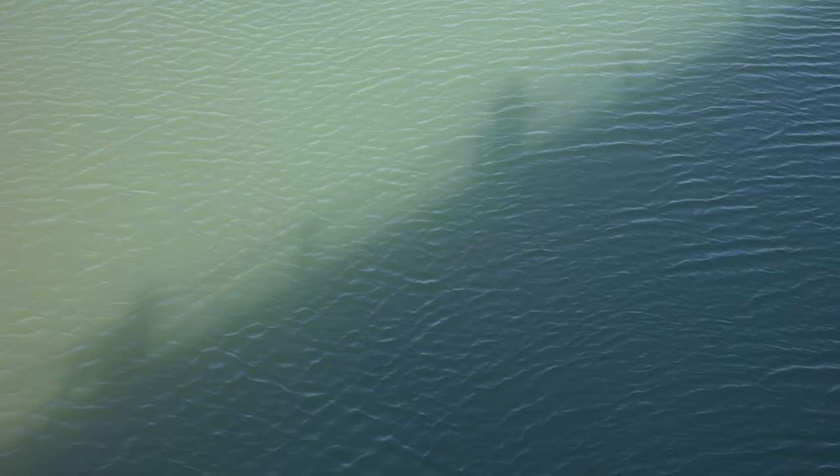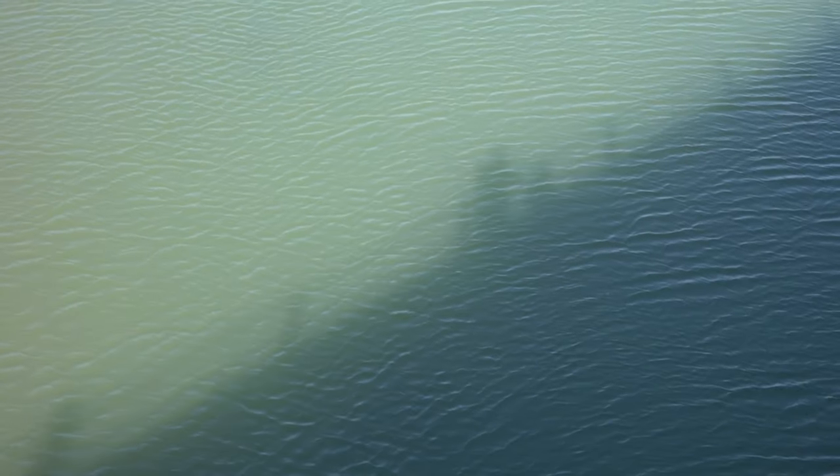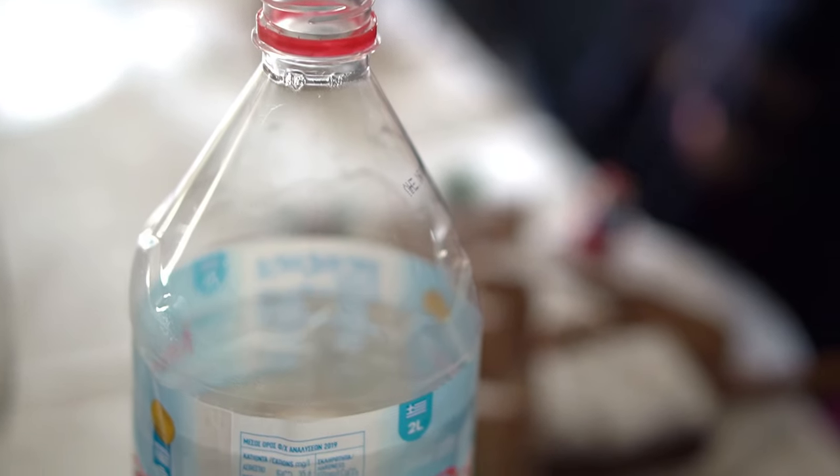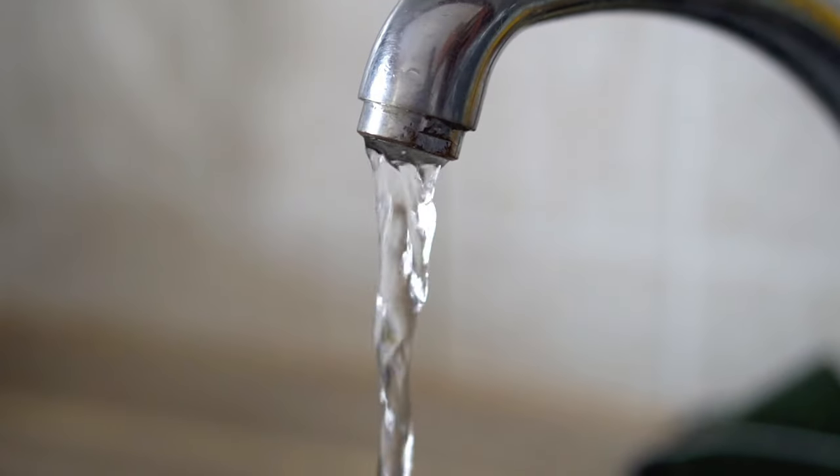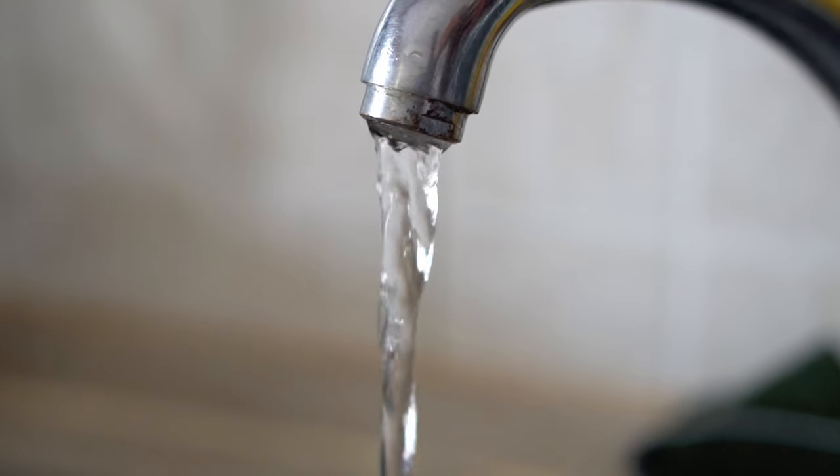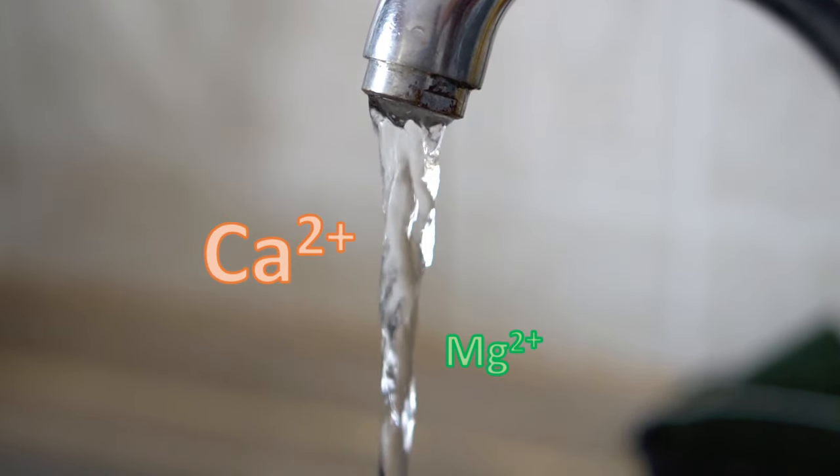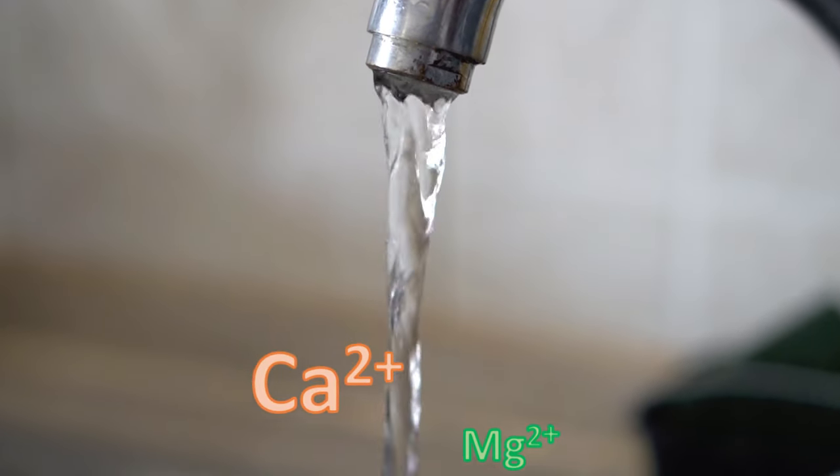Fresh water is not a pure substance, but rather a solution. Even rainwater contains several dissolved salts in the form of cations and anions. Drinking water, which can be bottled water or tap water, contains substantial amounts of dissolved multivalent metallic ions, mostly calcium and magnesium.